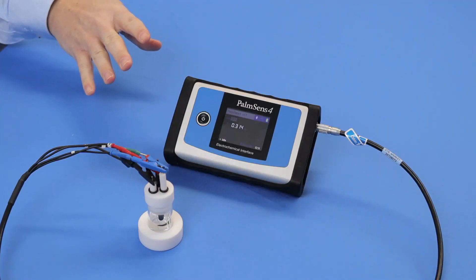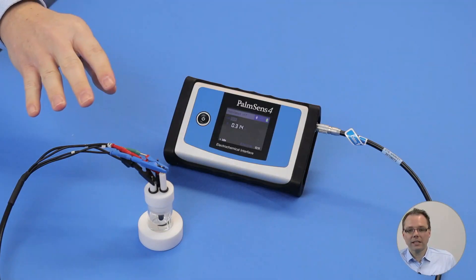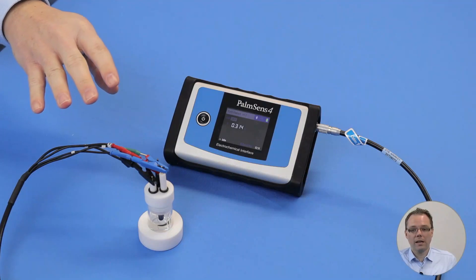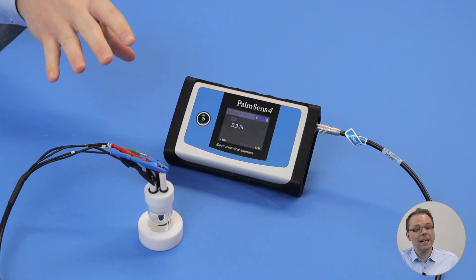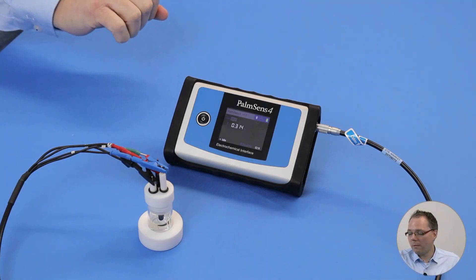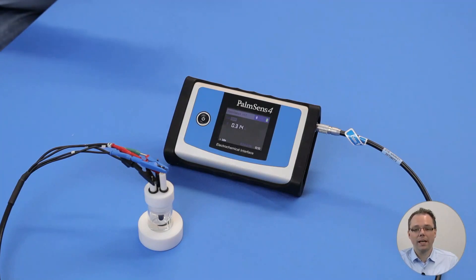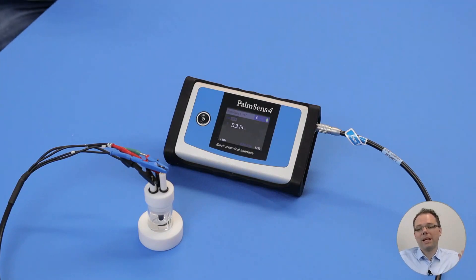As a setup today, I have connected via Bluetooth my PalmSense 4 and then connected it to a cell with classic electrodes: a silver silver chloride reference, a platinum wire counter electrode, and a platinum working electrode.